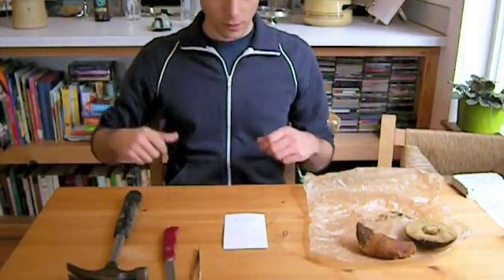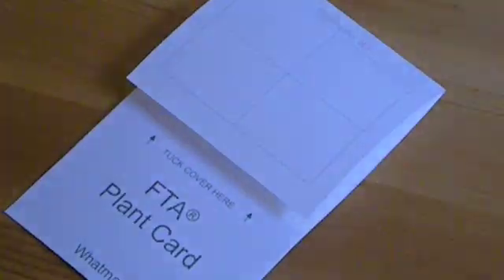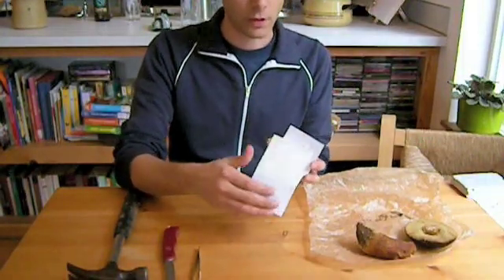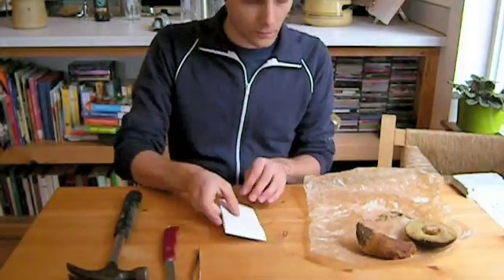Later on we can sample DNA from the specimens using these Whatman FTA Plant Saver cards. These cards have four sample areas and a laminated flap that folds over the sample area.